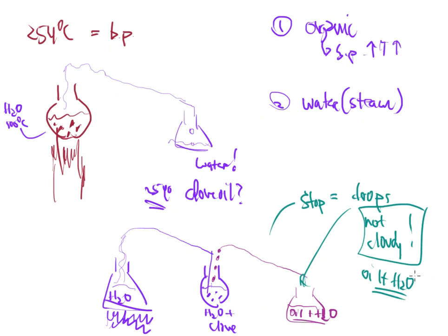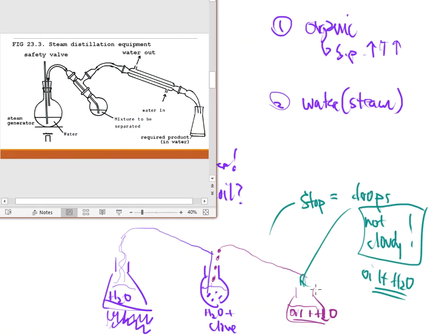So that is why a regular distillation will not work in this case. You need hotter temperatures, and that hotter temperature has to come from a steam source, which will increase the temperature of the clove oil, and that will make the eugenol volatilize and turn into a vapor and go up and over your distillation setup. Okay? So hopefully that seems to be okay with you.